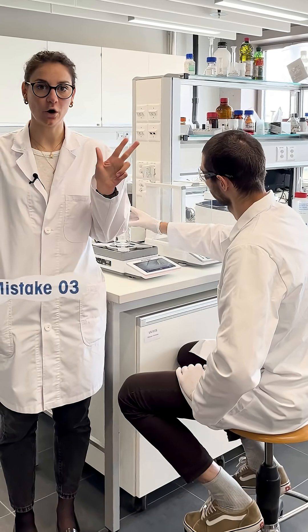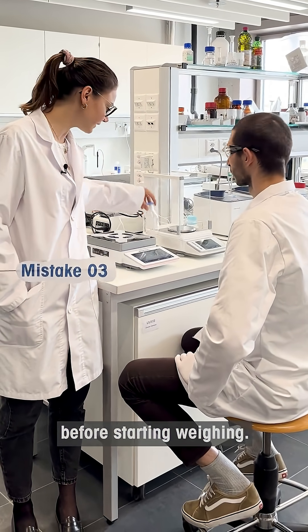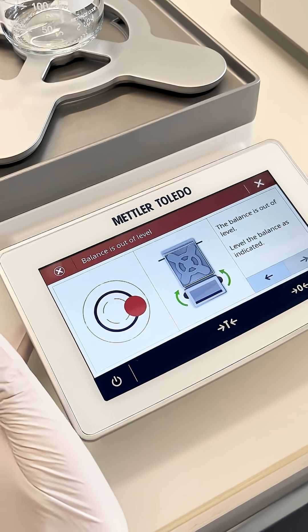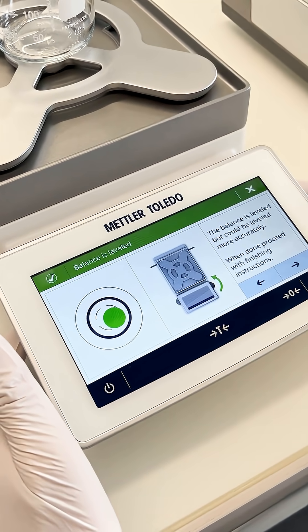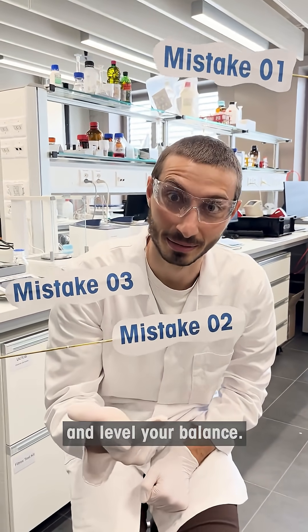Mistake number three. Always make sure to level your balance before starting to weigh. So again: tare, take care of your spillages, and level your balance.